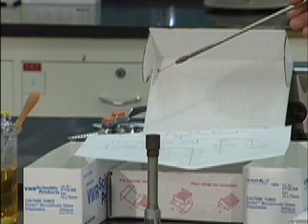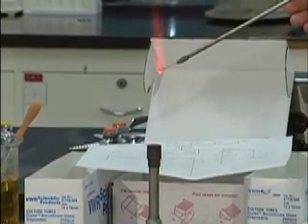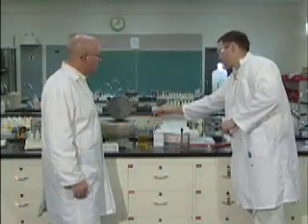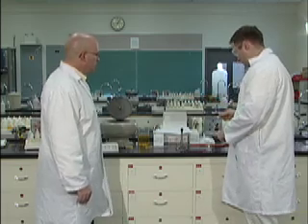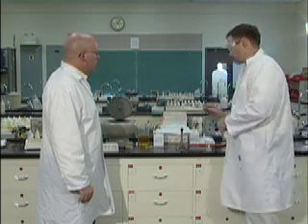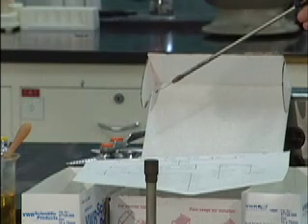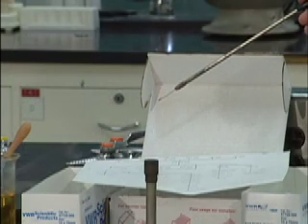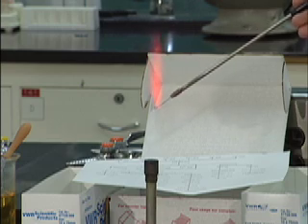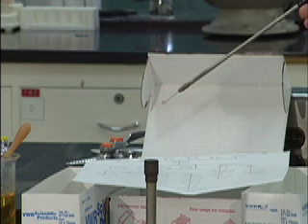And what you'll see is that for a sodium cation, it will burn very, very bright orange, like we just saw there. Oh, and if you want, you can throw a bit more on there. You can throw on as much as you like. And if it's a potassium cation, it'll burn purple. And that's why the cobalt glass will eliminate the flame. It's tough to see out here. Normally we do this in the fume hood. I'm seeing orange. A good orange, look at that. Bright orange flame. So our cation in this case would be sodium.